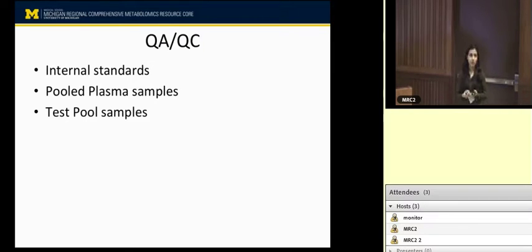Lipidomics, as already described, is a subset of metabolomics. Lipids share common physical and chemical properties, and they can be divided into classes. That's how they are different from the rest of the metabolites. Out of all the omics, lipids is a fairly new entry, and because of the advances in mass spectrometry based techniques, it has recently gained popularity. Lipid metabolism is, I would say, the least explored of all metabolic pathways, and the reason is that we don't have all the pathways for lipids.